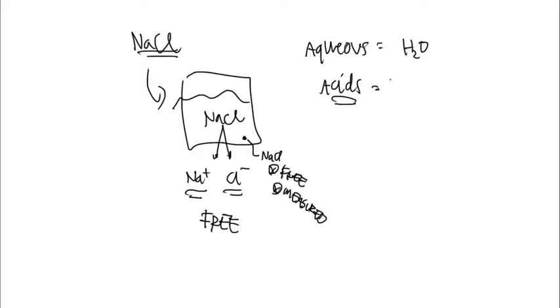And these acids could maybe be hydrochloric acid, or it could be nitric acid. And this helps those salts or those metal compounds to dissolve up a little bit more. Okay, that's why we use them in our solvent, and that's why they're present. So if you ever read a laboratory protocol that says, well, you've got to make sure that you add phosphoric acid or nitric acid or sulfuric acid or hydrochloric acid to the sample, this is why, because you have to ensure that all of these things get broken apart into the free atoms so that they can be measured.